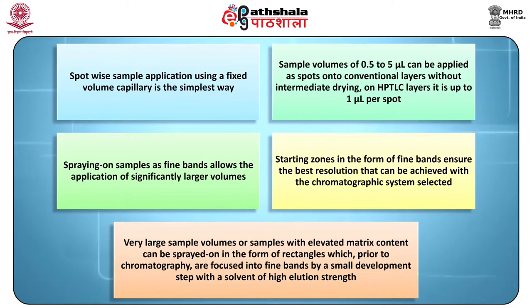To ensure best resolution, a chromatographic system should be selected such that the starting zones are fine bands. Very large sample volumes or samples with elevated matrix content can be sprayed on in the form of rectangles, which prior to chromatography are focused into fine bands by a small development step with a solvent of high elution strength.